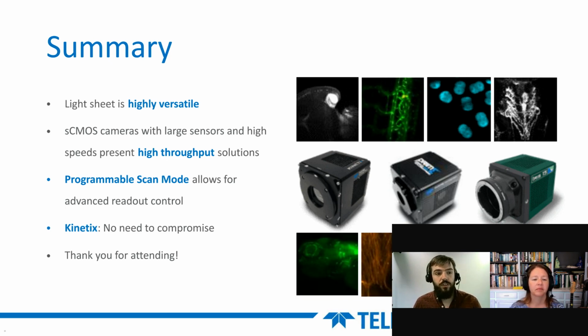As for protocols, we supply the driver for all of our cameras, which is PVCam. And this can always be pushed in one direction or another. So it's using a .NET framework. If you'd like it to use something else, or if you'd like your system to be adaptable with the driver, we have Python wrappers for the driver, and we can modify in this way as well. As for the NVIDIA Tegra system, I'm not 100% sure, but I can always get in touch with engineering, and I'll make sure I can send you a follow-up answer to that later on.